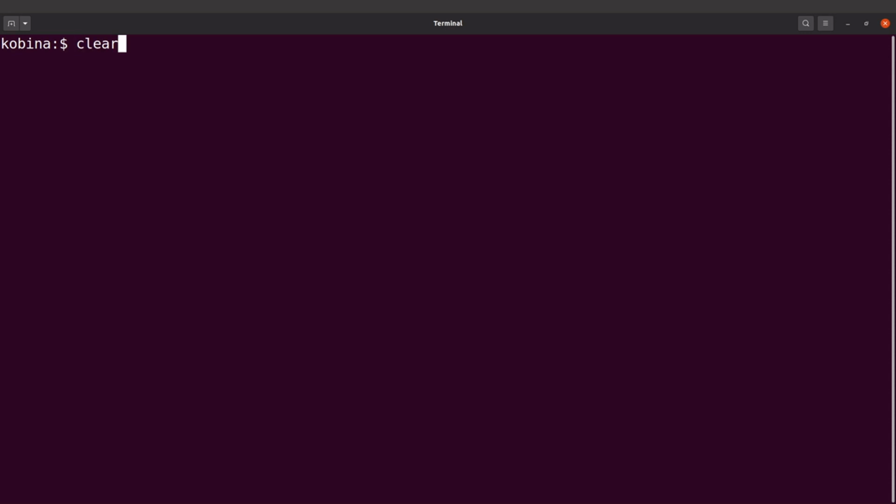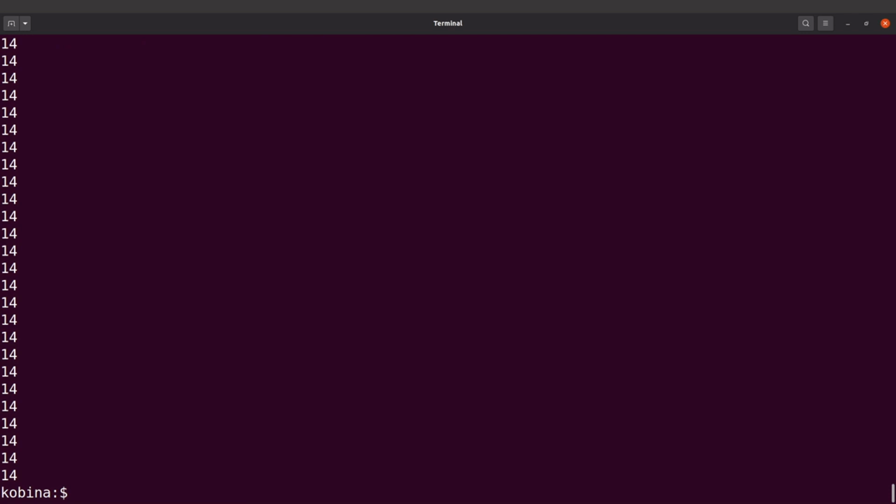So let's record the command again. And this time, we are going to add another character here called \n, so that the entries will be in separate lines. So let's now run this command. Perfect. So now you can see that everything has been done nicely for us. So now you can display them. But you also see that now we have just 14, 14, 14, 14, 14. If we just want to look at what chromosomes are there, we don't need all the repetitions.